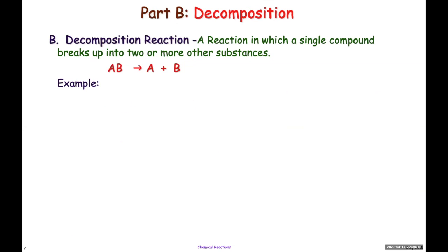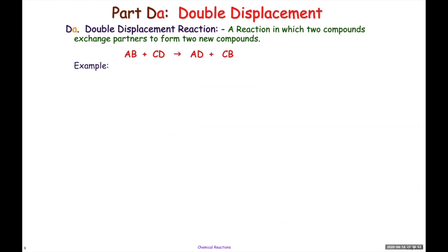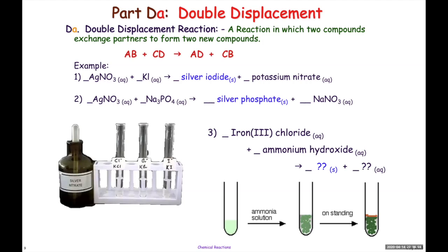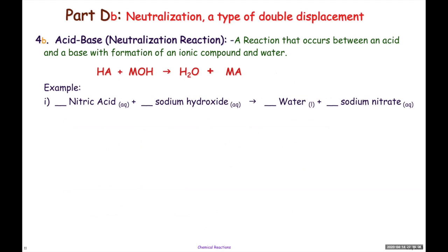Again, these are just more examples. I'm just going to run through these real quickly. You guys can peruse it at your pace. Okay. Some of these reactions here are the reactions that you guys are going to be seeing in this lab. This is an acid-base reaction.